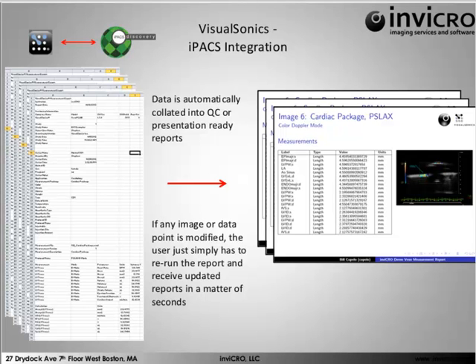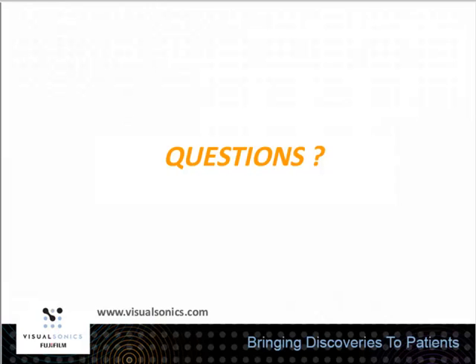All right, thank you, Bill. That should have shed light for those of you who are using Excel. I noticed that we did ask the question as to what data management tool you're using. You can see these are in some fashion similar to an Excel report, but it's much easier, much more streamlined to triage only the data sets that you want to see from this huge pile of data sets, so you can handle data-rich studies from the Vivo imaging systems. So on that note, we are progressing to the question section of this symposium. I'm taking a couple of questions in the interest of time.